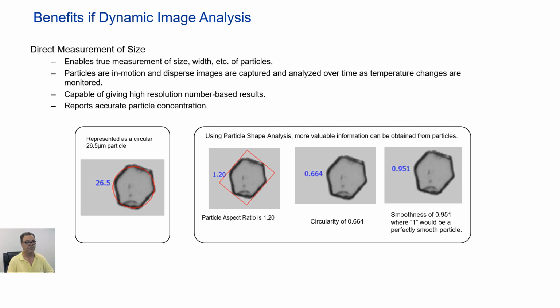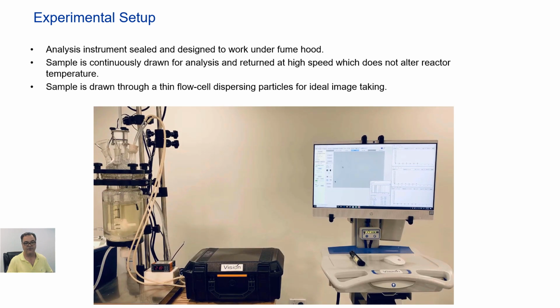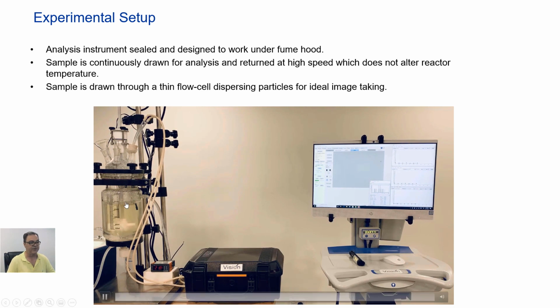Okay. So the experimental setup that we had made was one where you actually have a reactor here that's crystallizing some sample, and we have an instrument located with some insulated tubing very close to the reactor.